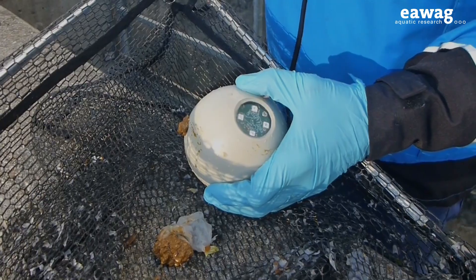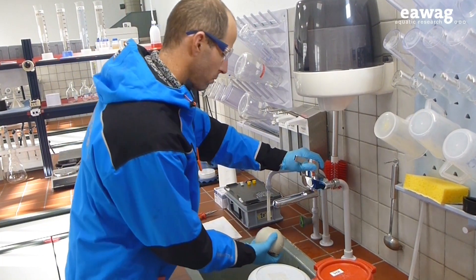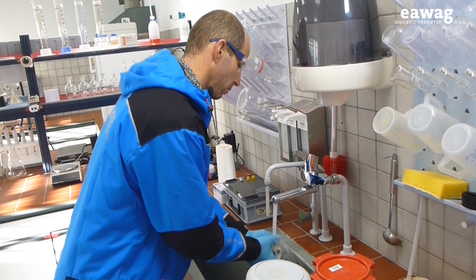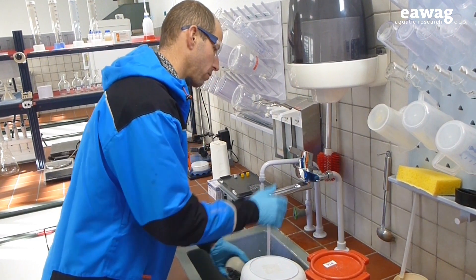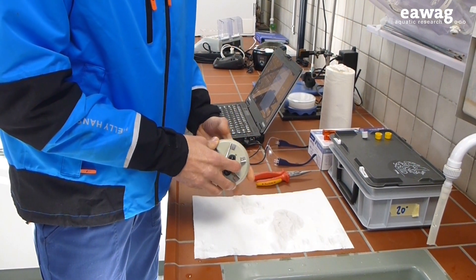The matter is not particularly appetizing. Back in the laboratory, the SQUID — sewage quality instrumented device — is thoroughly washed before the memory card can be removed and the data read out.